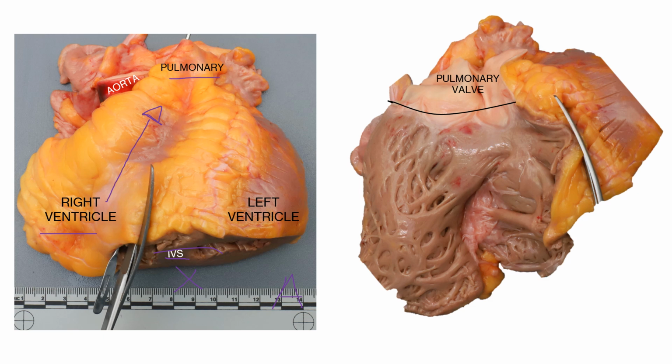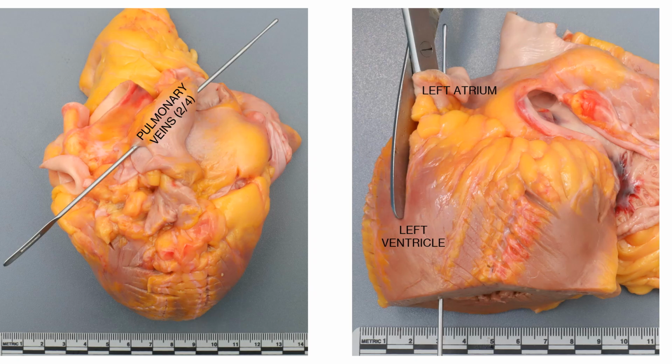This exposes our pulmonary valve, which has a cusp system. And again, from cut to cut, getting our circumference. So again, pulmonary going to the lungs, returning back from the lungs via the pulmonary veins. So once you have them probed, I would go ahead and open up, again, exposing your left atrium.